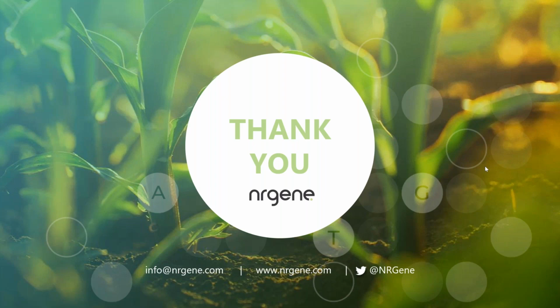How well does your panel differentiate full sibs? Differentiate what? Full sibs. Oh, okay. So we are actually testing that very question right now. We have already tested this with a small panel of full sibs, and we've been able to detect all of them.